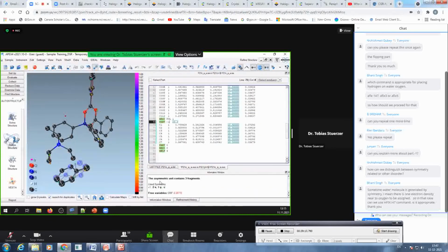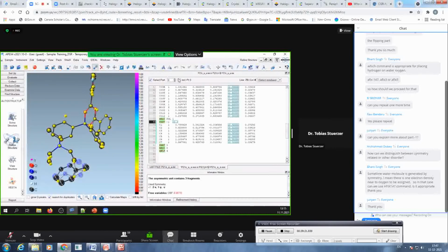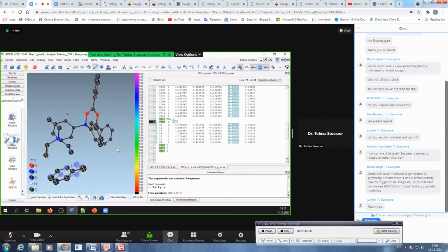Are you answering, Carsten, the question? Okay. I think also with this part it would work. I never checked it. Let's take part -1. Oh, no, it doesn't work. Does not work. Okay. Good.